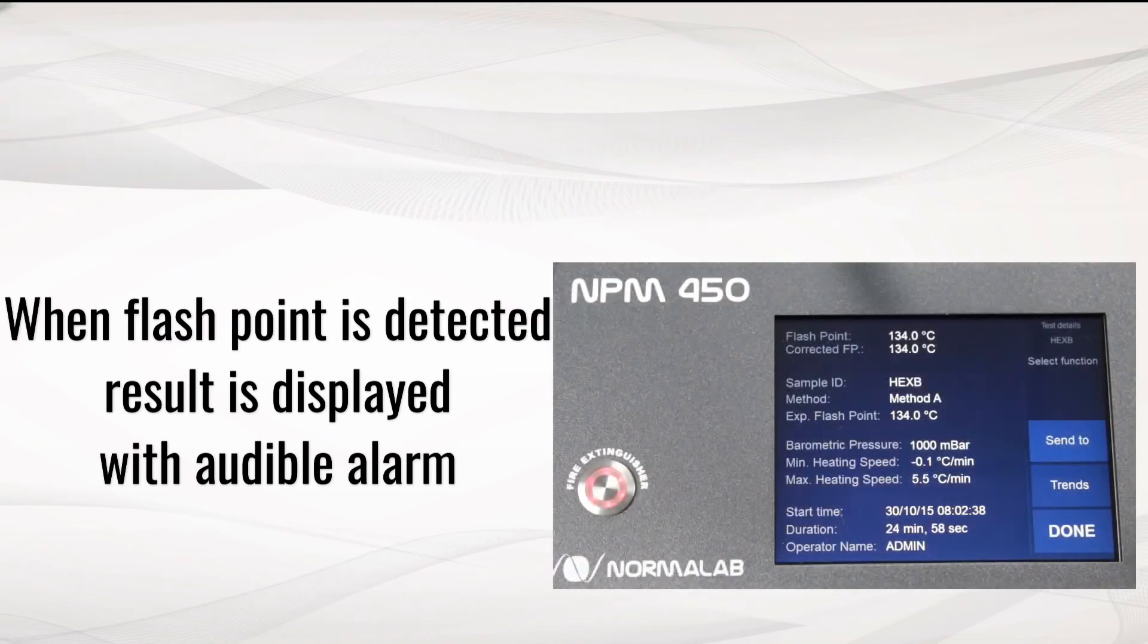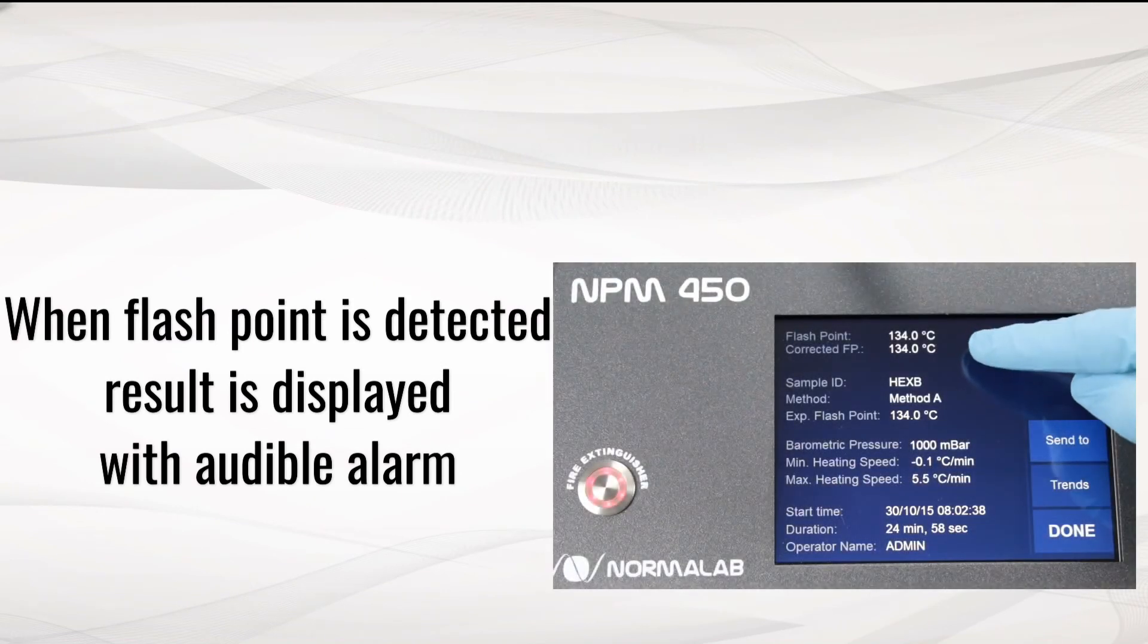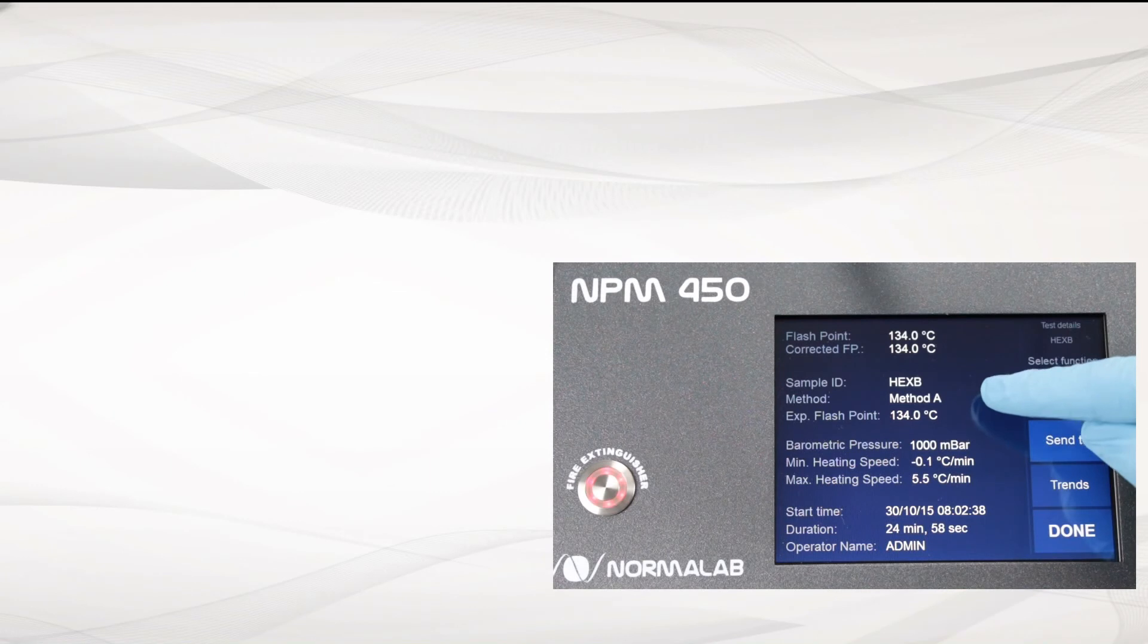When sample flashpoint is detected, the result is displayed with an audible alarm.